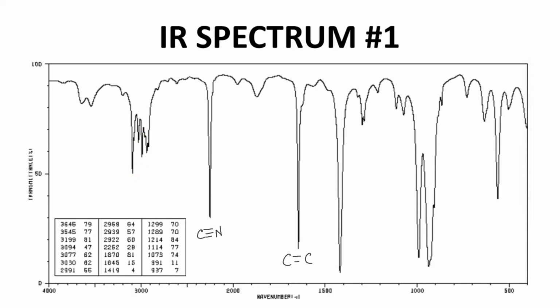Those are typically sp2 CHs. That's another sign of an alkene. Great. These signals around 3500 are tempting to call an alcohol, but alcohols normally have very strong peaks, not little dinky peaks. I don't think these are important.